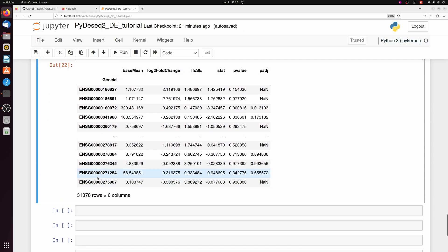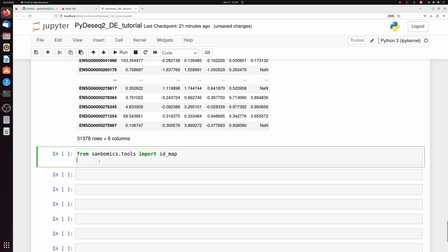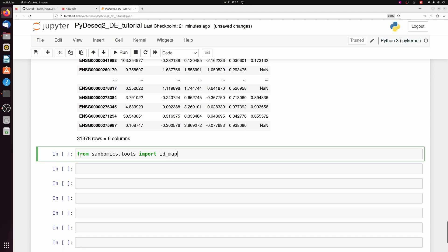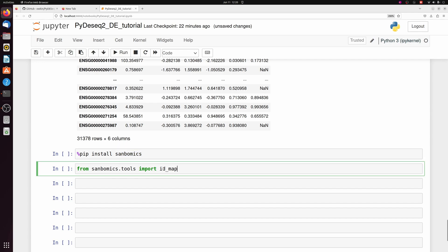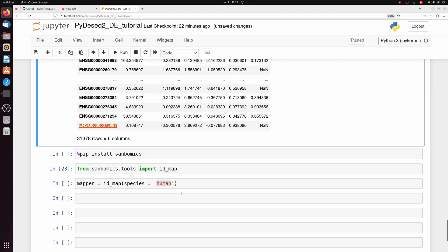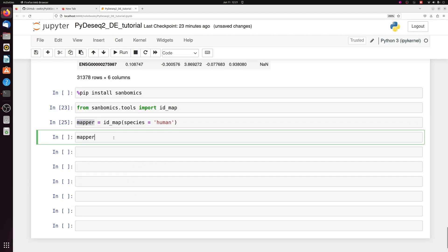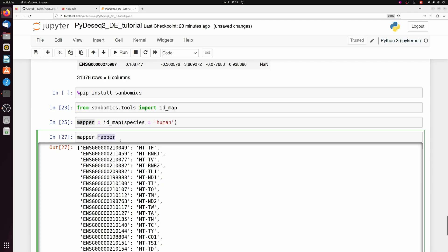But first, let's convert these ensemble IDs to actual gene symbols. And I actually have a tool that I published to do this easily in Python. You can go ahead and install my package like this. And then we're going to use my ID map tool. And we're going to make a mapper. We have to specify that the species is human. By default, it's looking for ensemble IDs. So we don't have to change any of the other parameters. This would just be a dictionary now with all the ensemble IDs and the gene symbols.